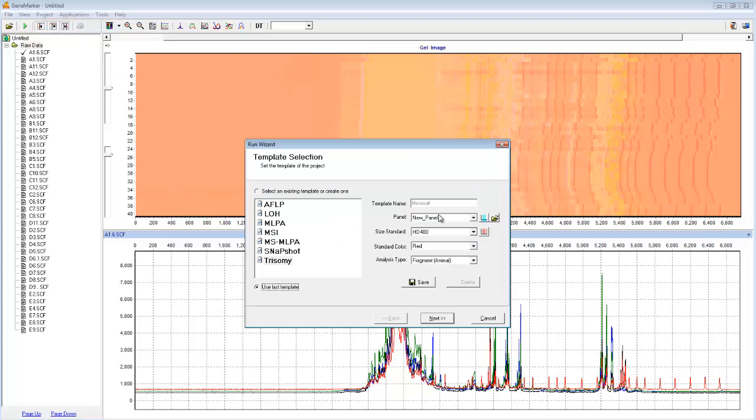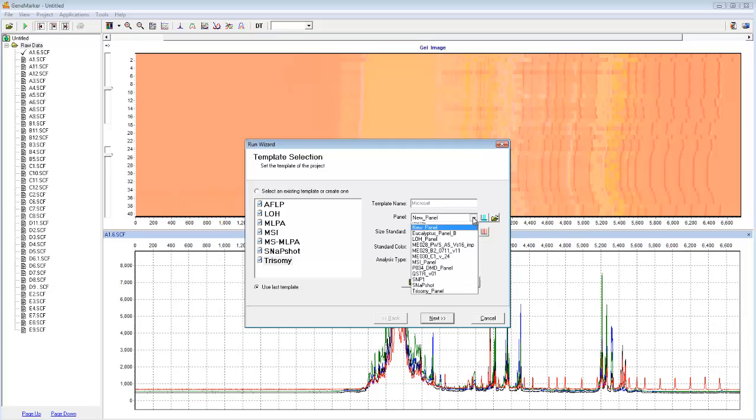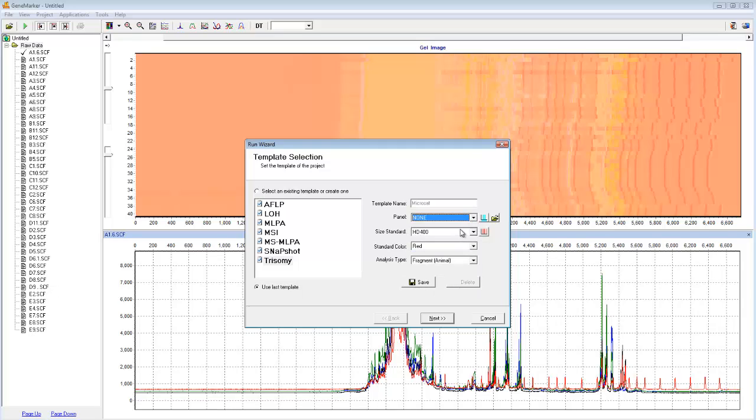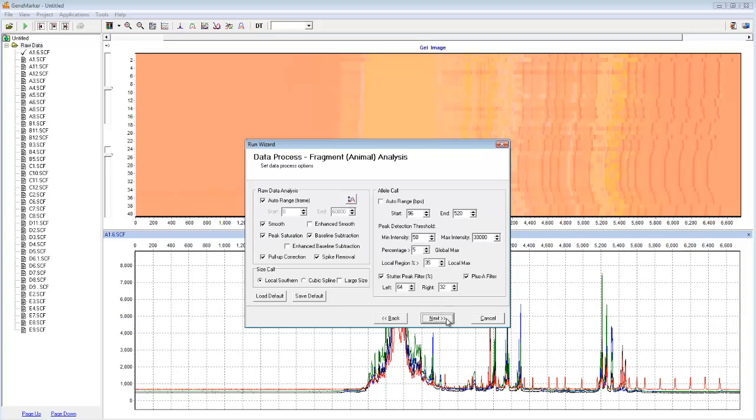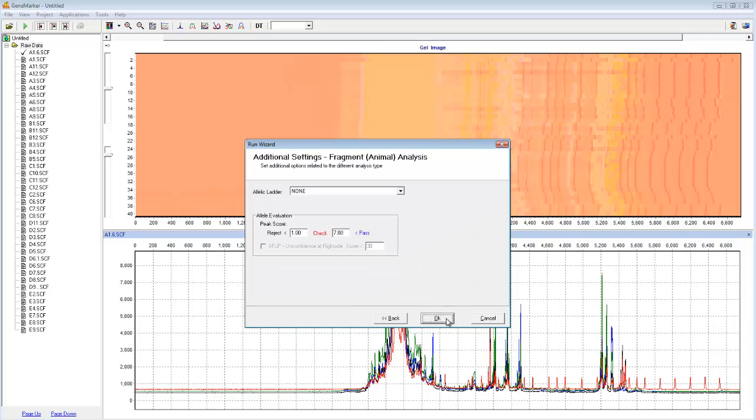Because I haven't yet made a panel for this dataset, in the panel field, I'll select None. The size standard I know was HD400, and I can clearly see from the raw data that the standard color is red. Finally, I know that my analysis type was Animal Fragment. As is usually the case, the default settings of the run wizard are appropriate for this analysis, and because of that, I can simply click Next, Next, and OK.